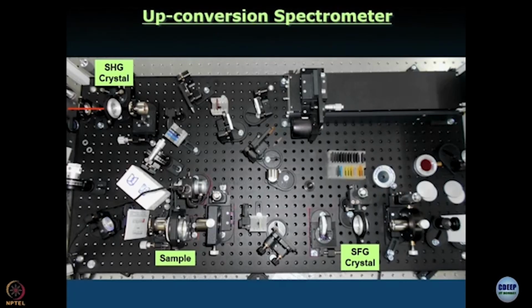And the wavelength of the laser that we have can be tuned from say 700 nanometer to 1000 nanometer or so. Let us say that this red light that we are showing you here has a wavelength of 800 nanometer. Of course, if I say wavelength of 800 nanometer, it is not very difficult for you to work out what the frequency is, because frequency and wavelength are related by lambda nu equal to c.